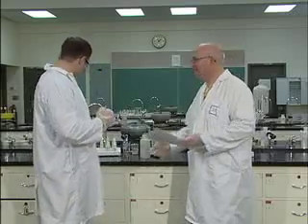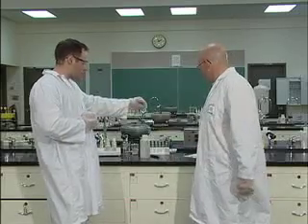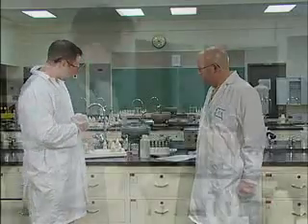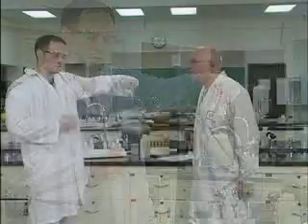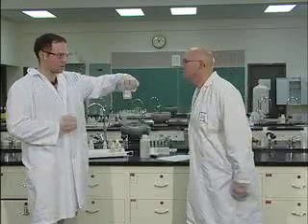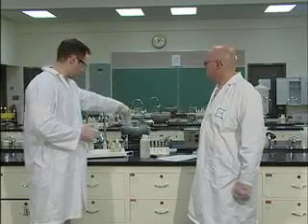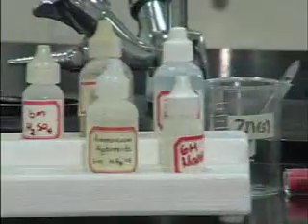So the first one we're doing is a composition reaction. Actually, before we even start, all of the chemicals you will need will be on your tables. You'll also have zinc metal that's already cut to size for you, and magnesium metal, which is also already cut to size. You'll notice there's a big caution sign under the magnesium. That's because when you add magnesium to acid, it gets very warm, so be careful with it. So don't add the acid to that beaker here. No, don't do that.